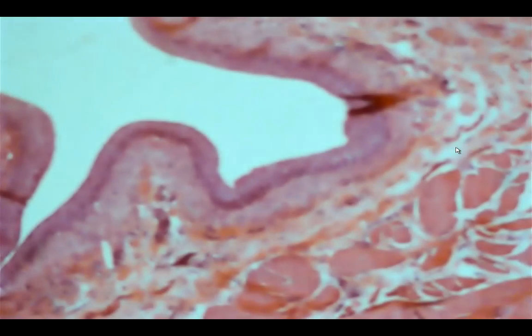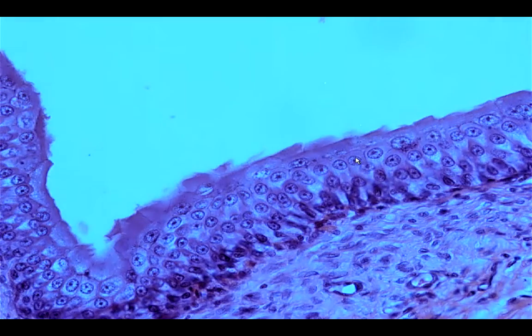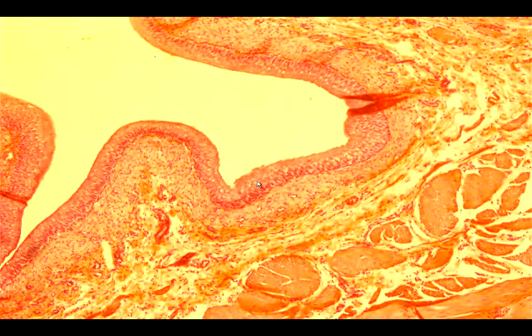The urinary bladder is identified by having a lining epithelium, which we would call the transitional epithelium, characterized by a multi-layering of the transitional cells. And the transitional cells would be identified by having similar polygonal cells around nuclei from the basal portion to the surface. Okay, so now we go to the layers.